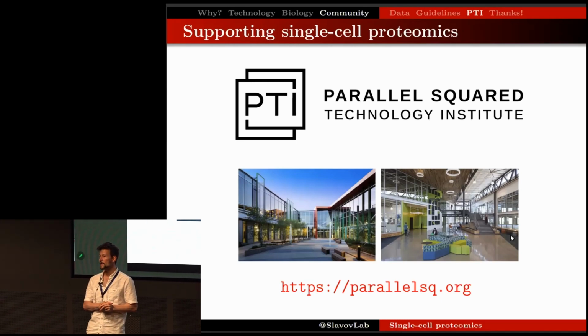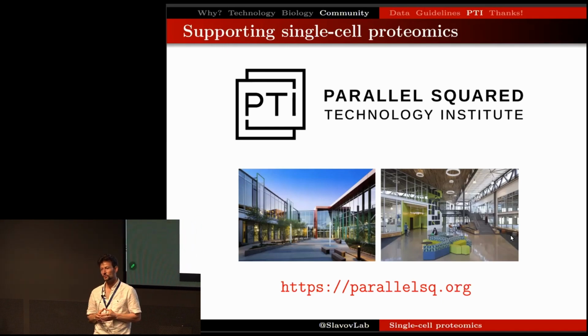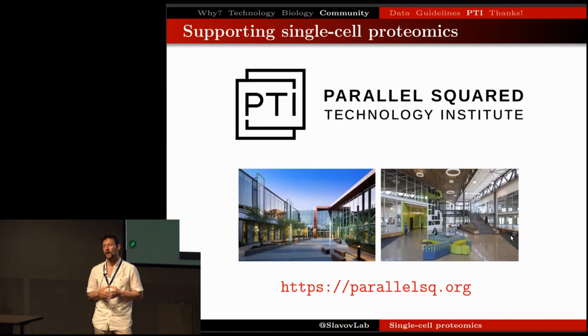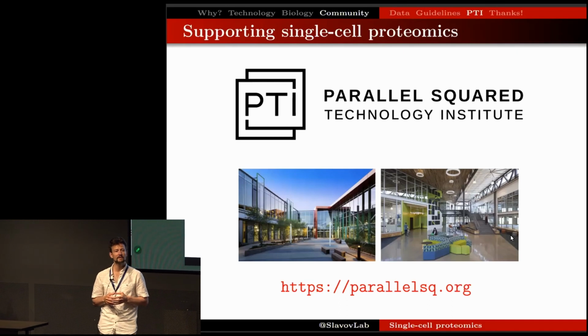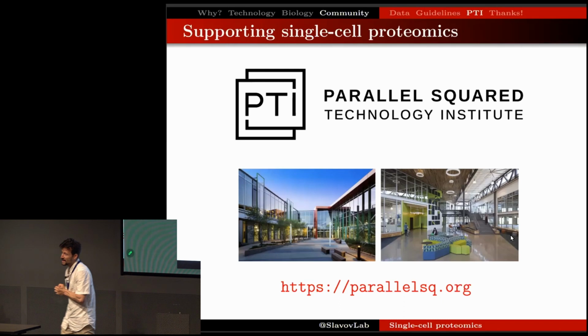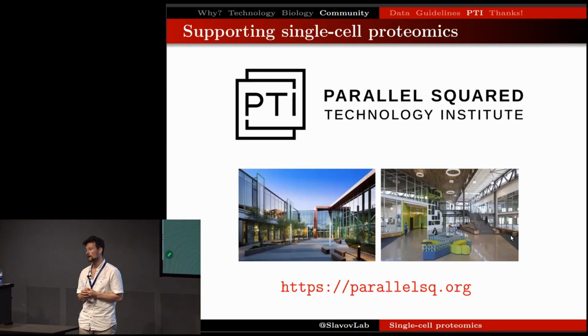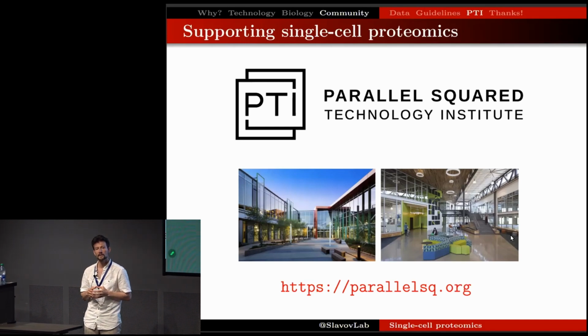It's about 3.5 miles from here, where we are building up the capacity to scale up single-cell proteomics. We want to increase plexDIA to high plex. We are certainly not happy with having 3 or 5 labels. We think that there is a capacity to have many more. And ultimately, we really are very enthusiastic and fond of applying those technologies to big biological problems that have resisted previous efforts.